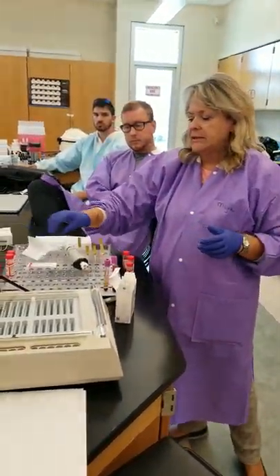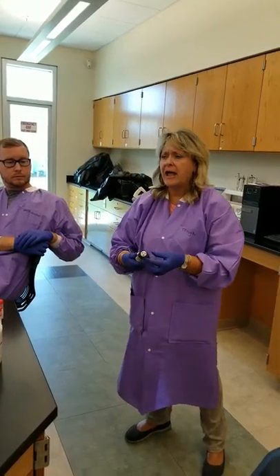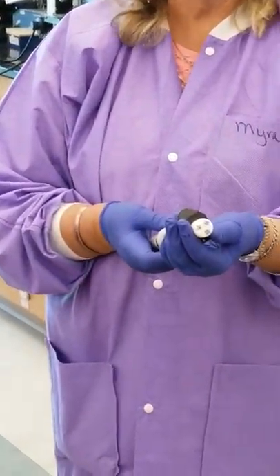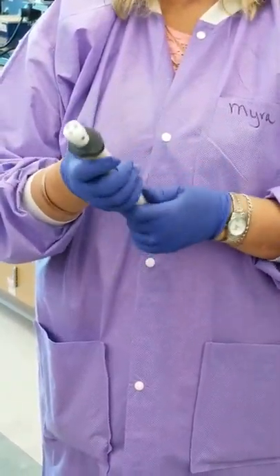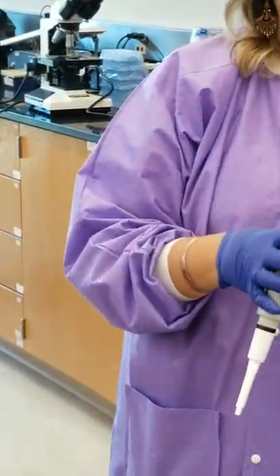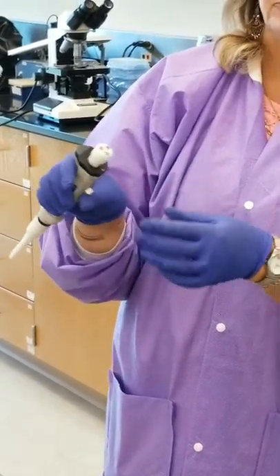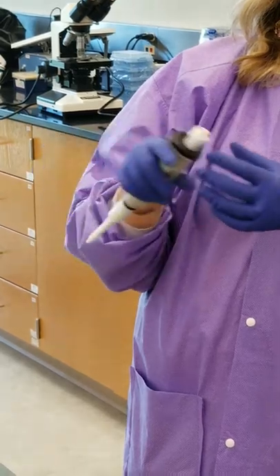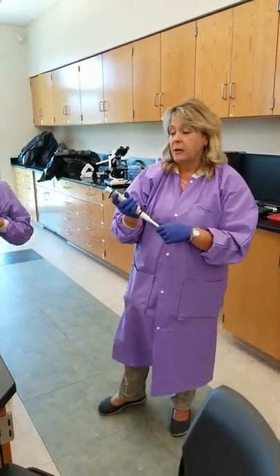Okay. This is the pipetter that goes with it. The pipetter has channels that are useful for what we need. So we can change the volumes, and then it's multi-dispense for the same volumes. We use 50 microliters. We use 25 microliters primarily, those two. And then on occasion, we'll use a 12.5 microliter. So we have them all here, so we don't have to go hunt pipetters up.